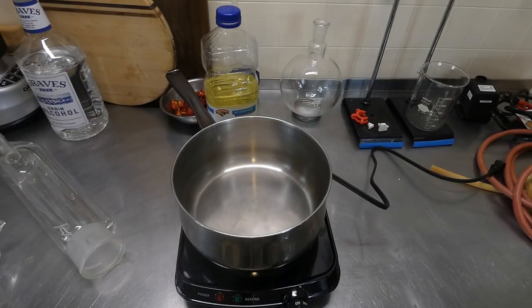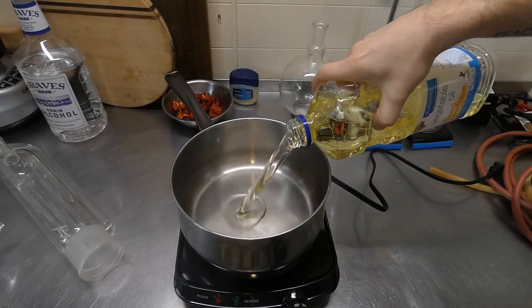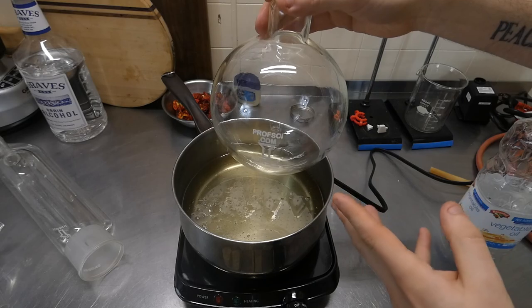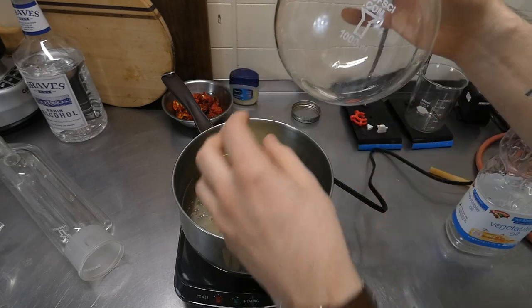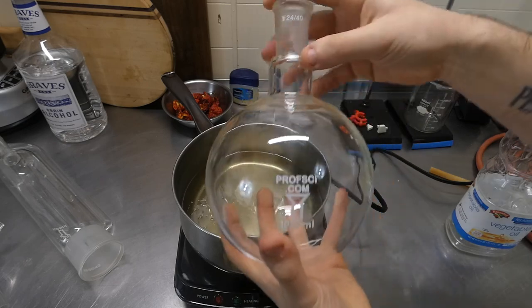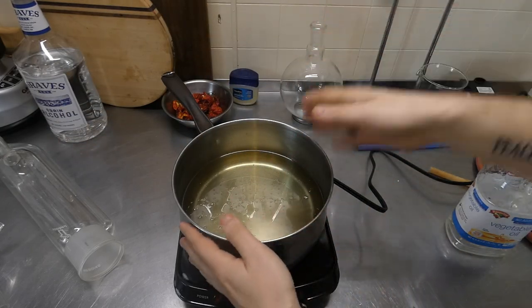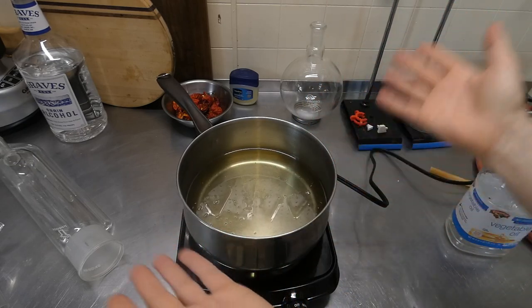All right, so the first thing that we're going to do is take your vegetable oil and pour that into this pot here. Now, we're using this because when we put the ethanol and everything in this flask, ethanol boils very rapidly and very quickly. So this helps so that it boils more evenly and there's less chance of it bumping out of the flask and going up into the condenser itself. Water boils too fast, it would evaporate, whereas oil doesn't, and the oil's reusable.